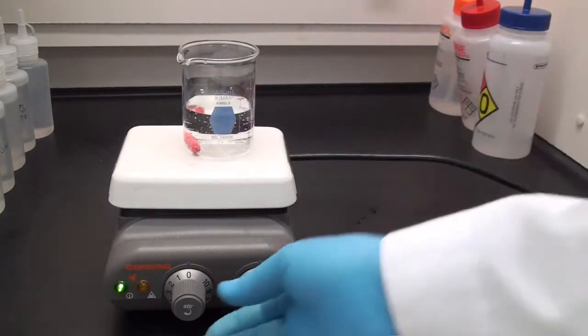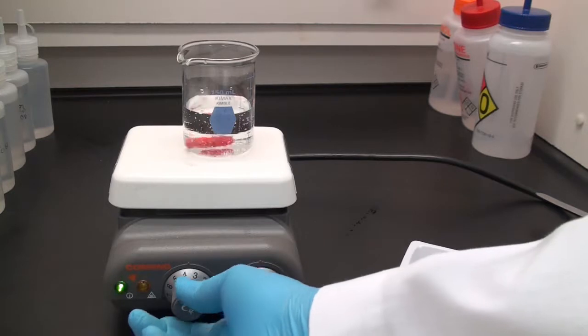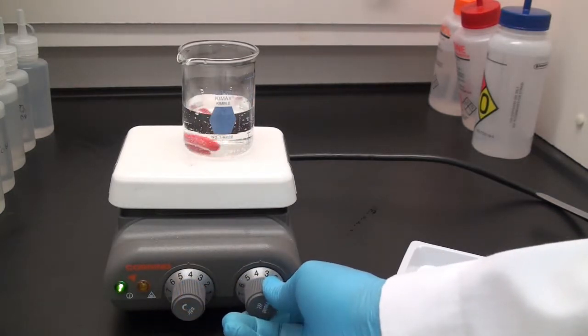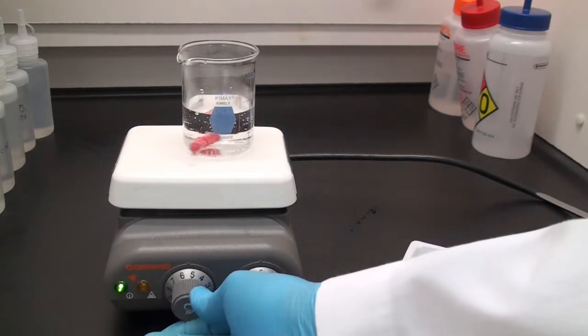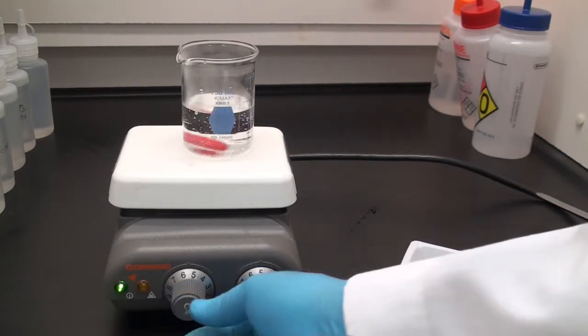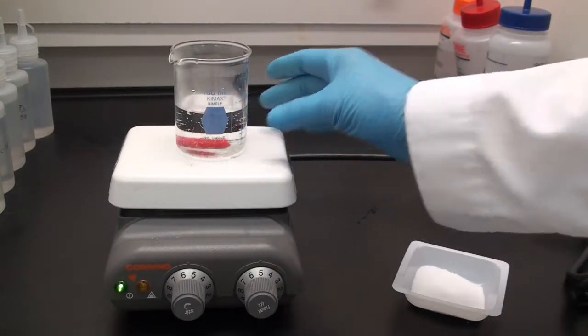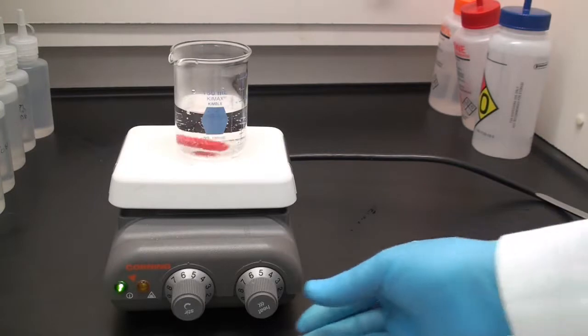I'm going to put that on and get my stir bar going. It's a good idea to start stirring before you start adding the solid. Otherwise, it could form a mass for some materials. I'm also going to turn the temperature up to try to maintain my 60 degrees as much as possible.